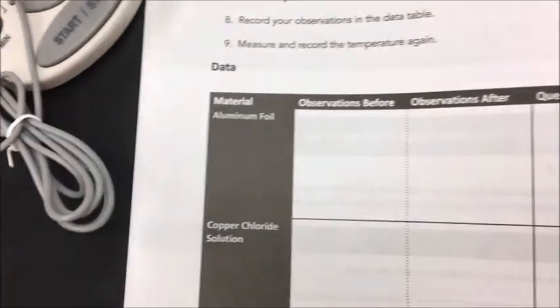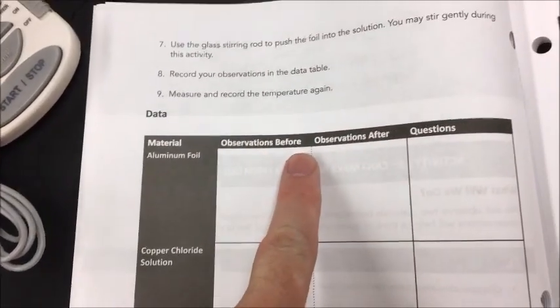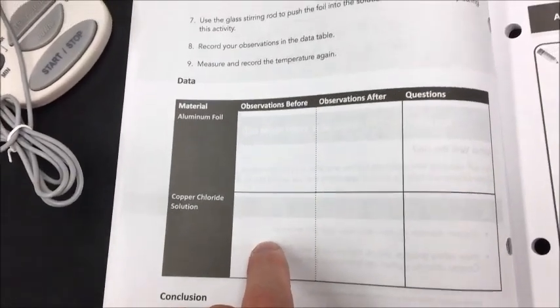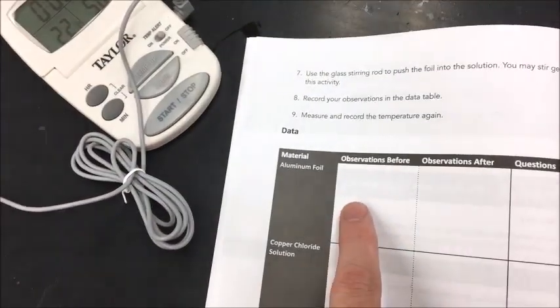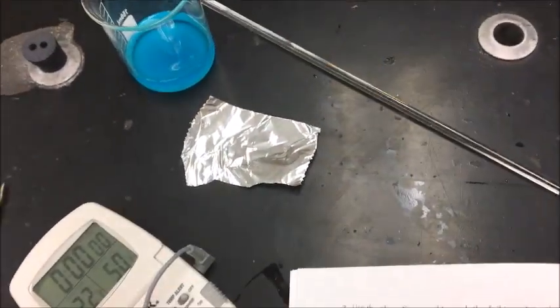So you'll write that down right here, because this is observations before. After you've recorded your observations — what color is it, what's the temperature — including the aluminum foil. What do you notice before about the aluminum foil? You can even write the weight measurement that I gave earlier for that.